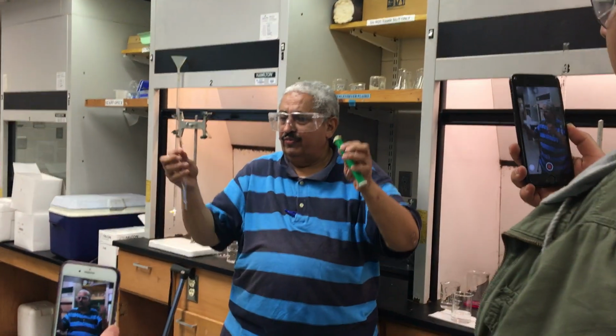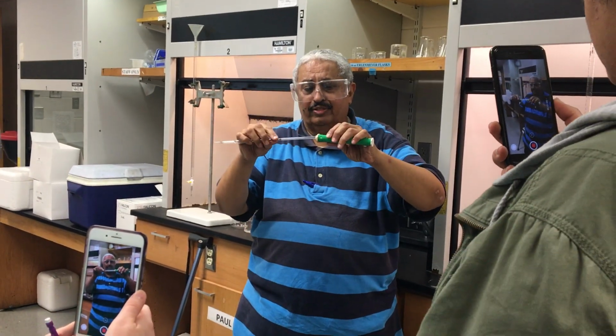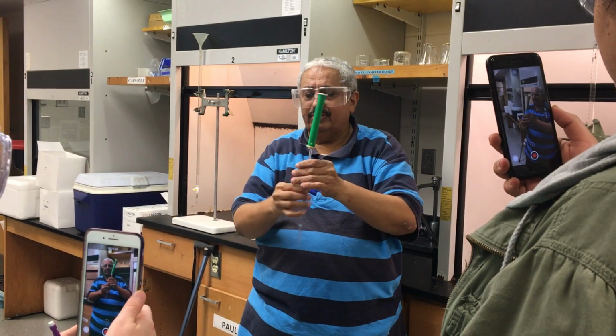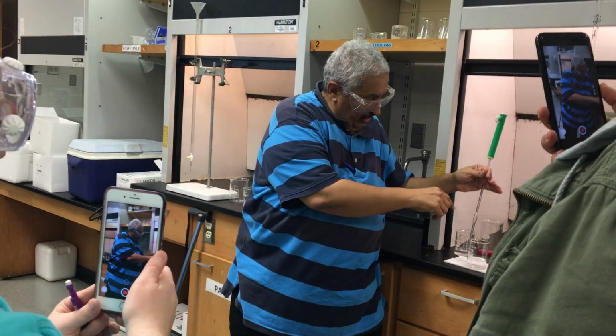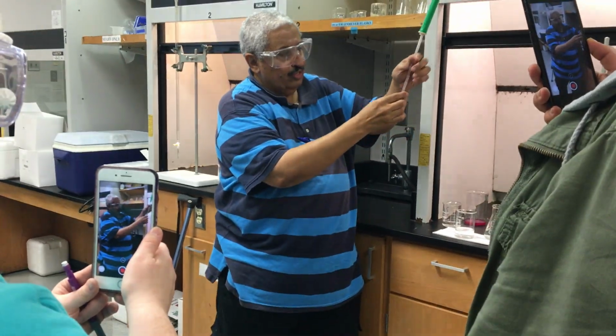So now with feeling, I don't have to push it, just sit it like this. You don't have to push it very hard, just sitting like this, correct? And I'm trying to get 2 mL up to what line? To this line here. Can you see it?